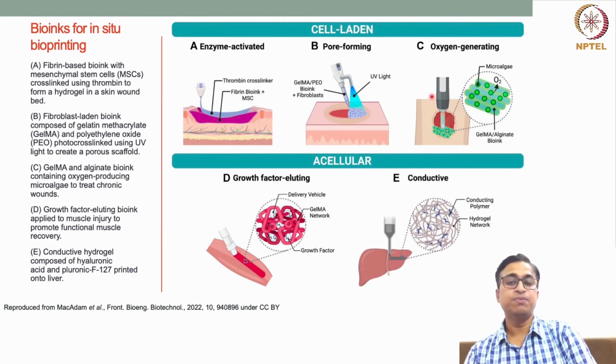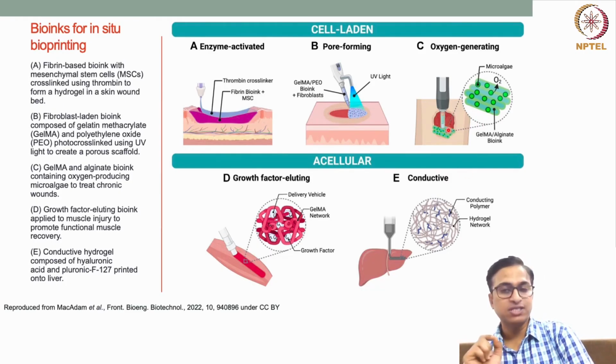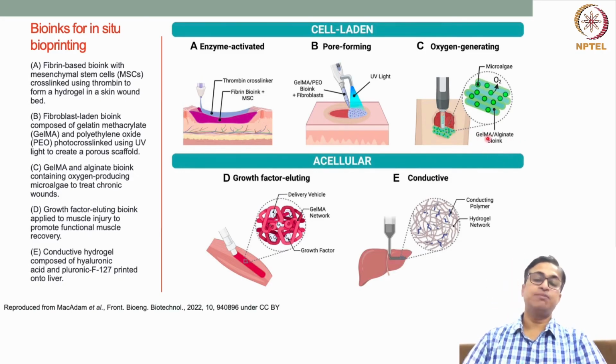The next thing is another example, or another strategy, where suppose we incorporate some kind of oxygen generating particles, or in this case they have used microalgae. This microalgae can be incorporated with Gelma plus alginate bioink, right? This bioink combination. Gelma we have already discussed.